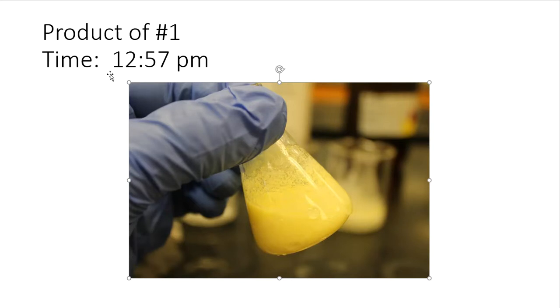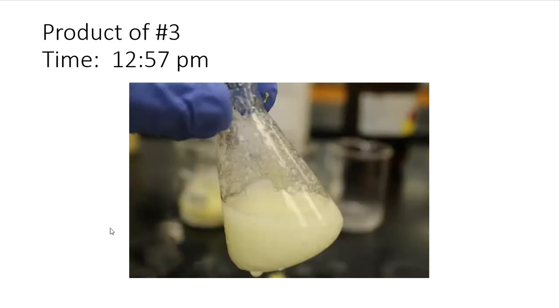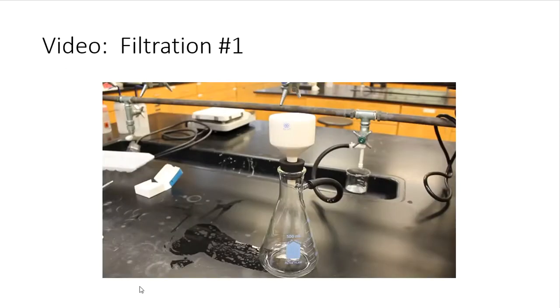So here is basically the product of number 1. That is what that looks like, 12:57 p.m. Here's the product of number 2 after it stood and sat. That time is 12:57 p.m. And here is product number 3. And again, that time is 12:57. So we now need to filter. You now know what these look like after the reaction period, after the addition of water. And now we're going to filter these things one by one.